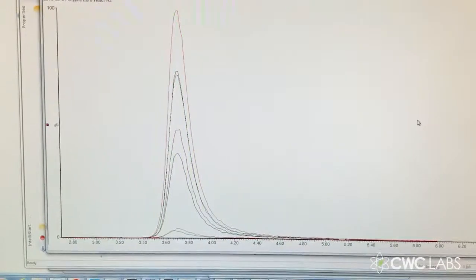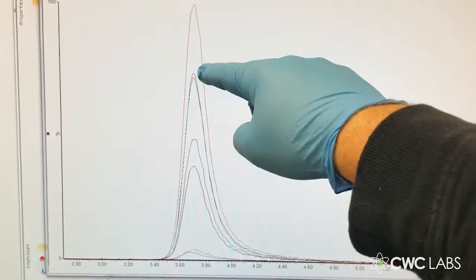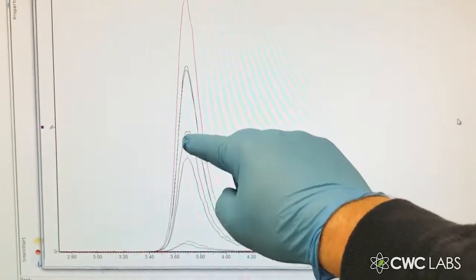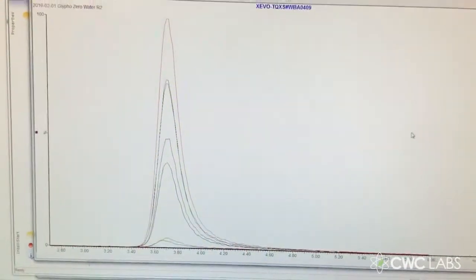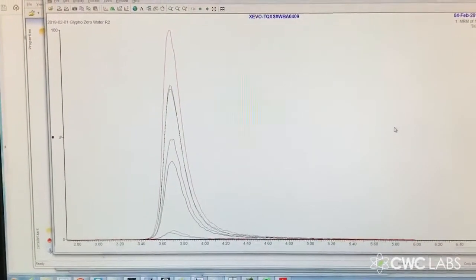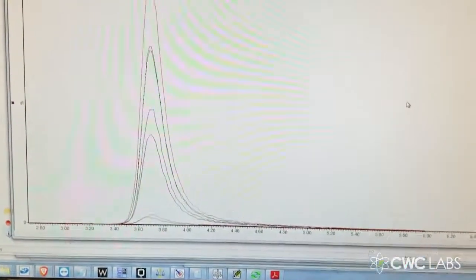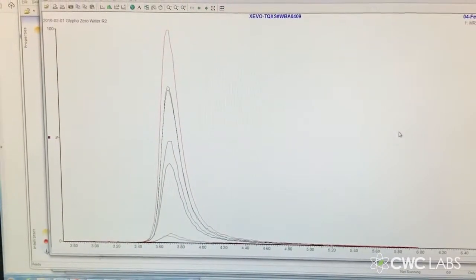Which I'll explain later. But some of the water pitchers perform poorly because they don't remove much glyphosate, as you can see from these peaks here. And these perform sort of mid-range, but these are performing extremely well. Overall, these are performing much better than the sports bottles, which is kind of expected because it's a larger filter media in the water pitchers compared to the water bottles. So right away we can tell that the pitchers are more effective than the bottles as a general trend.